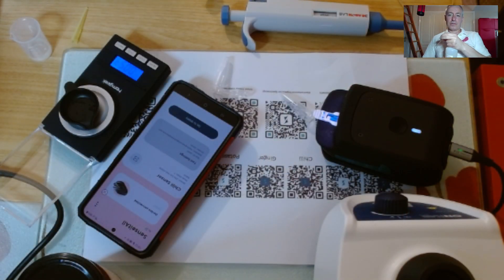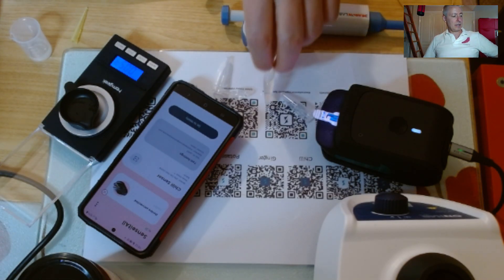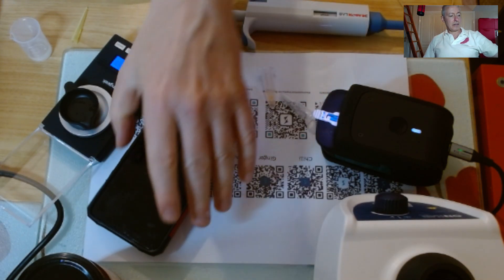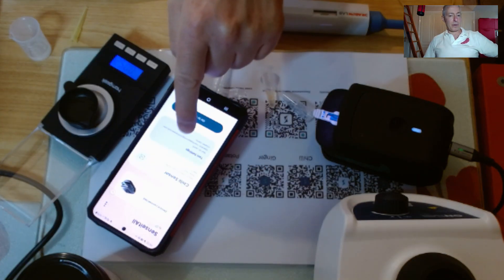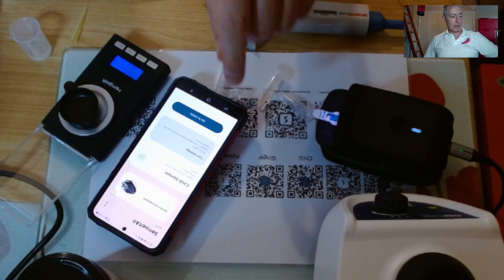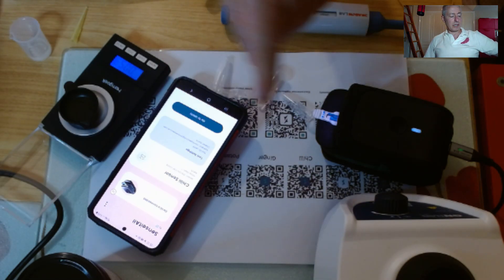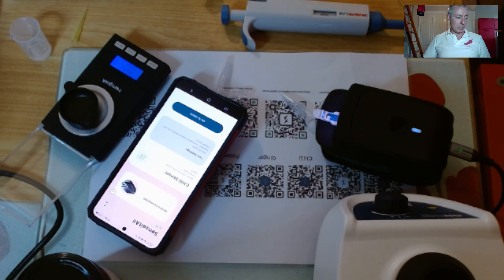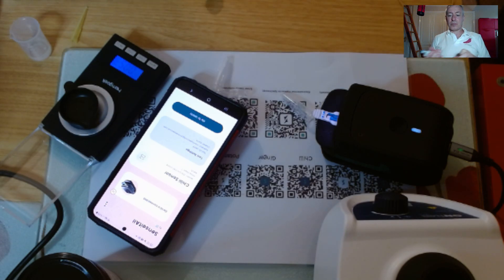When I say the buffer, the Food Sense Generation 4 comes with 500 mils of buffer, so you can appreciate how many tests we can get out of that. So I've got the meter here, I've got the app, and I've got the sensor on here. The app tells the meter what to do, the meter will give the data back to the app, and then I'll get a result on my phone. I'm going to put 50 microliters of this sample onto this sensor.